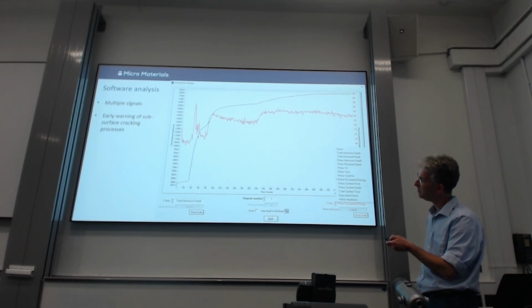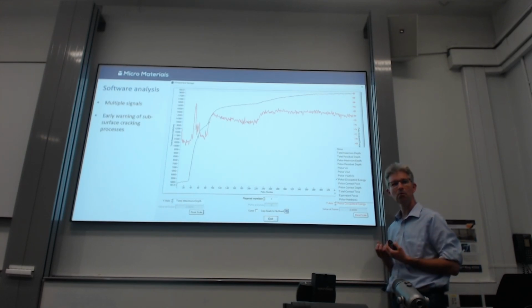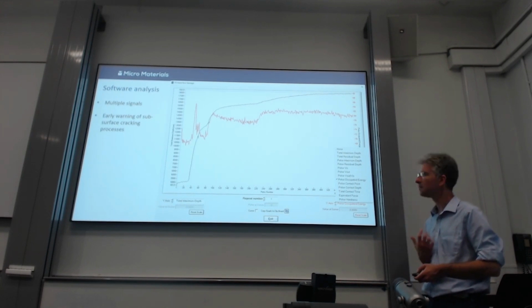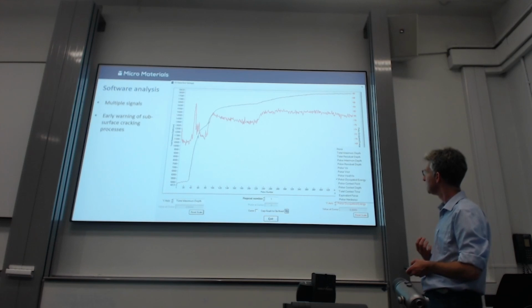energy dissipation, so if anything, that's going sooner. So that's an indicator that you might have this sort of early warning system. And we've looked at this a few times, and in some cases there's definite legs in terms of looking at multiple signals together, giving you extra information. So we're quite encouraged by that.